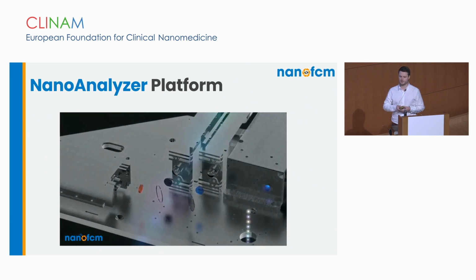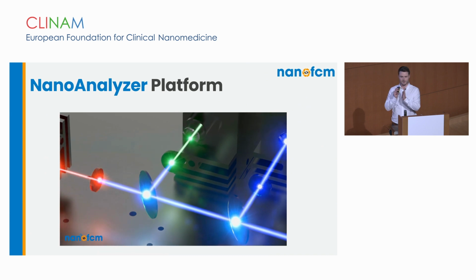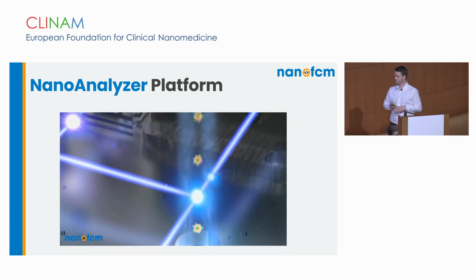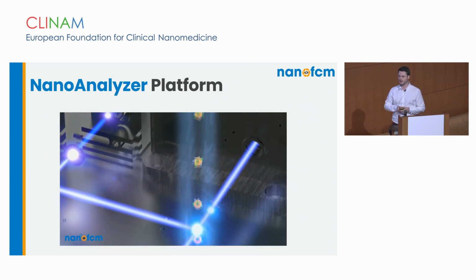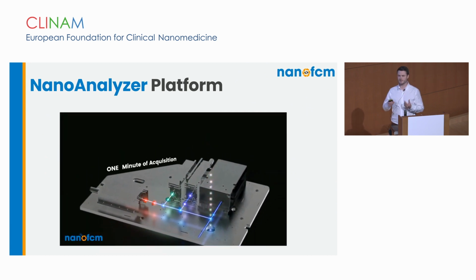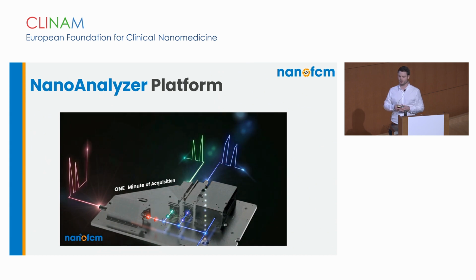That's then pumped up and into the flow cell with a highly controlled pump, where really the different things that we're doing is we're focusing down that sample stream to a really narrow 1.4 micron stream, so we get a much more true single file movement of particles through the laser. And we've also slowed down that movement, so we get an increased dwell time of these particles in front of the laser, so we can gather more light information and fluorescent information per particle.